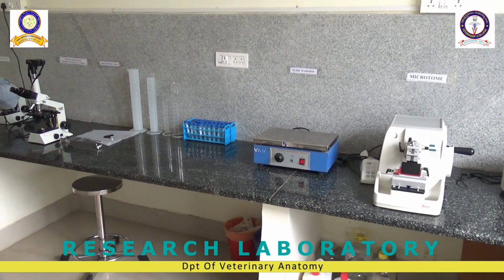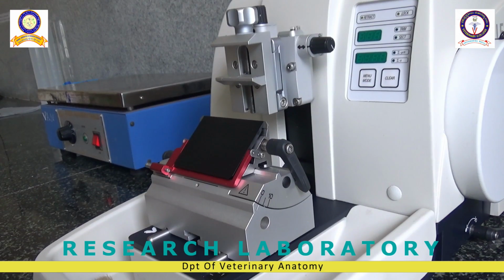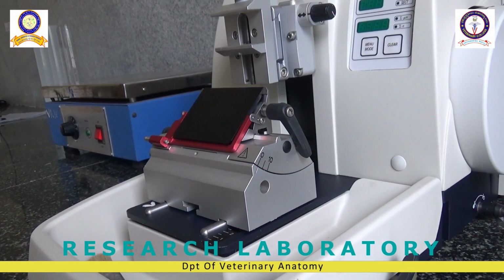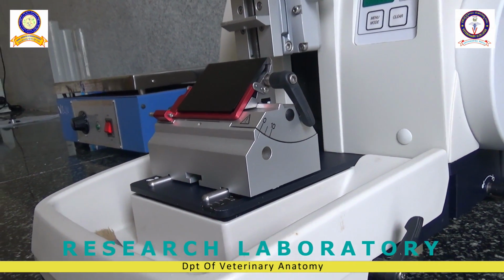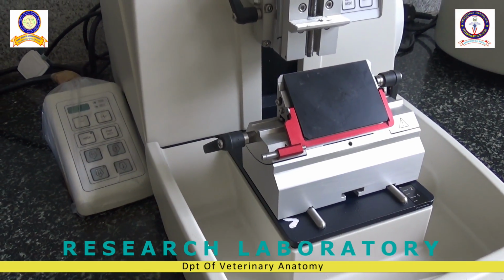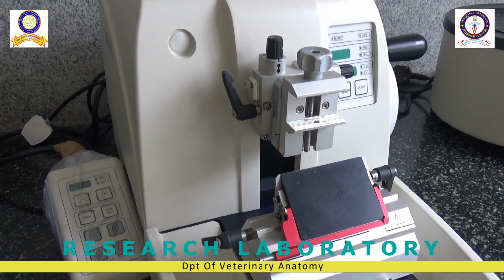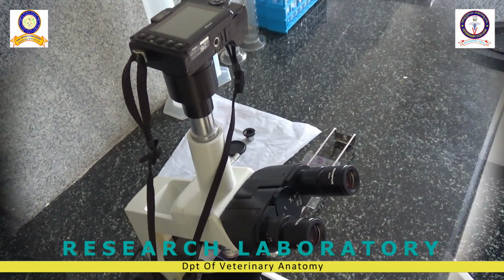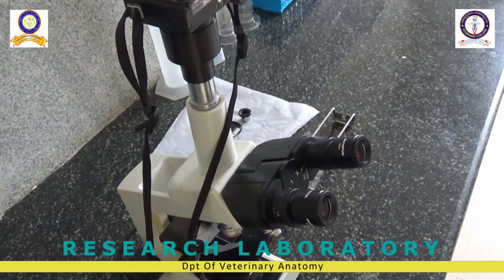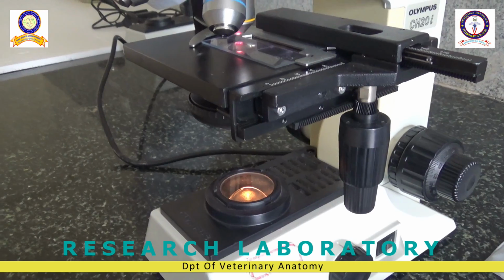So we have the department well equipped with the different equipment needed to conduct the undergraduate program practicals, and we also have some higher end equipment like semi-automatic microtomes, a deep freezer, and a trinocular research microscope with CCTV camera, and also a stereozoom, which will be helpful for the PG research program and also the staff research program.